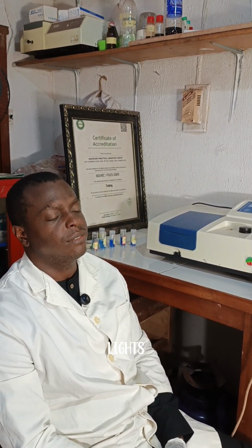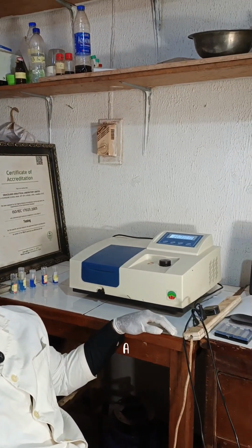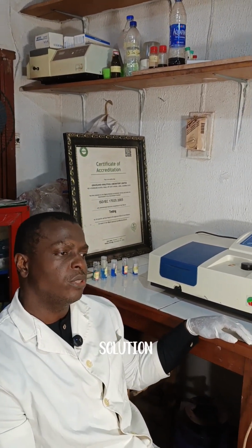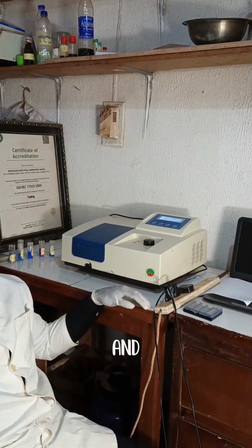First of all, UV visible spectrophotometry lies in the absorption of UV visible light from the electromagnetic spectrum. If a UV visible light passes through a substance or a solution, some of the light will be absorbed and some will be transmitted.